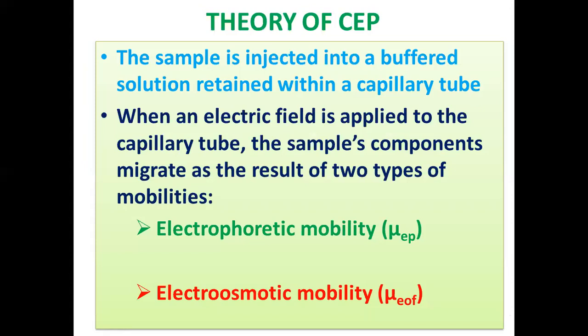While performing the separation of solutes by the capillary electrophoretic technique, it is very essential to understand the theoretical aspect. So what is the theory of capillary electrophoresis? We need to separate solute molecules which may be charged or uncharged, neutral, acidic or basic, whatever it is. They might have a lower molecular mass, or they may be macromolecules. After the introduction of the sample into the capillary tube, they will be separated based on their capability to migrate in the conductive medium.